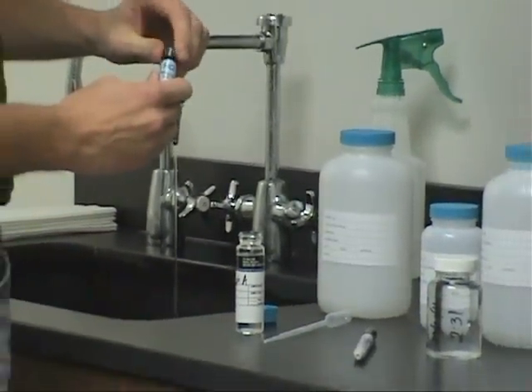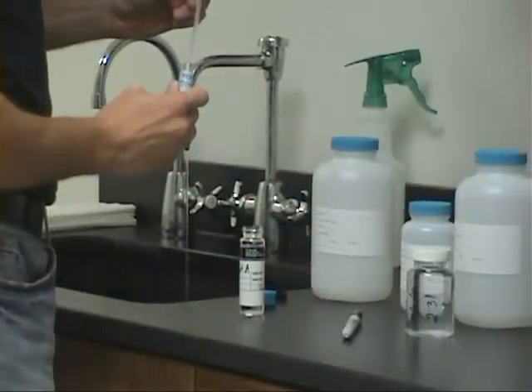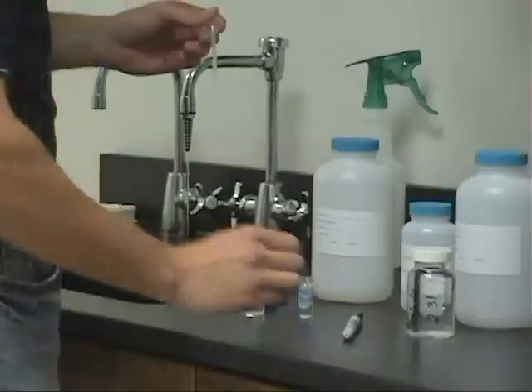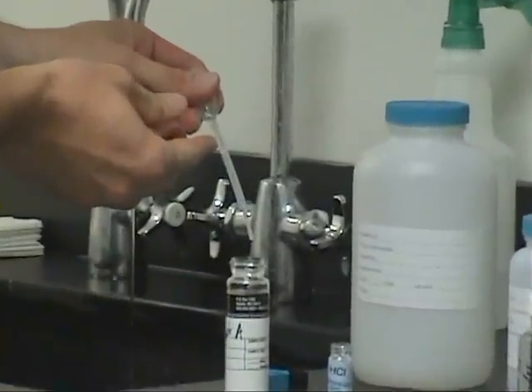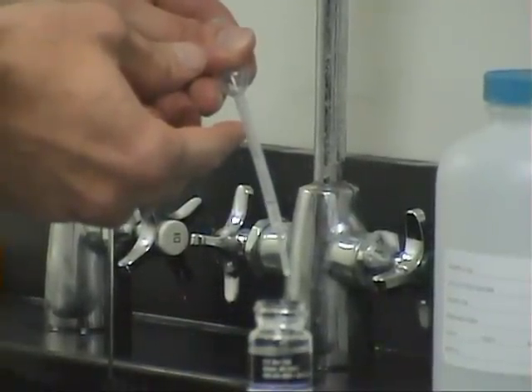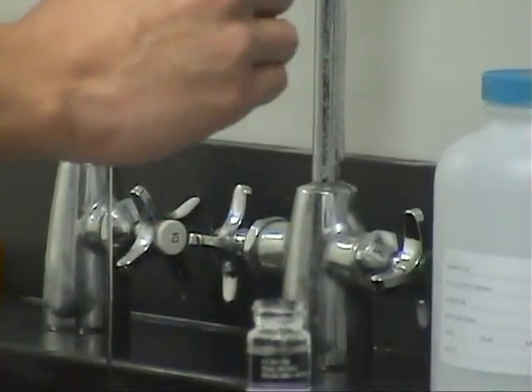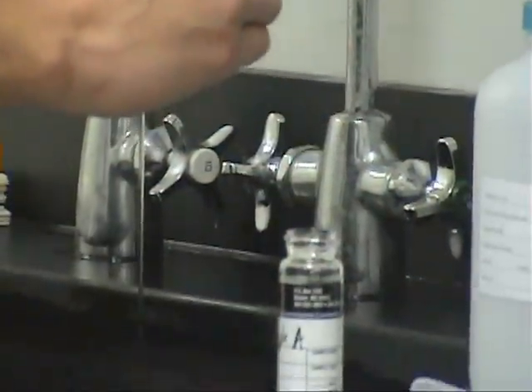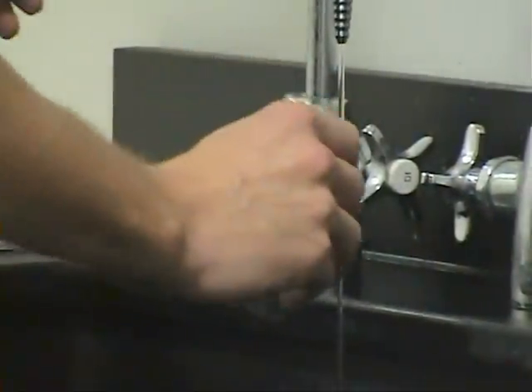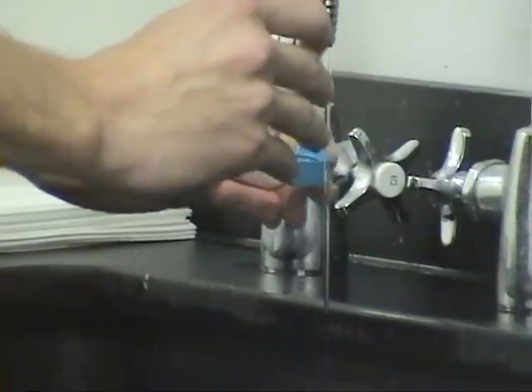Add 5 drops of hydrochloric acid provided by the laboratory. Be sure to use caution when handling hydrochloric acid. Carefully fill the vial to the top, allowing a water dome to form on top. This is called a reverse meniscus.